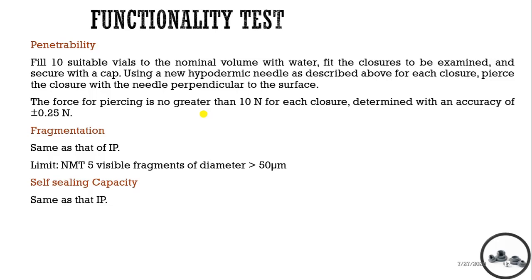Using a new hypodermic needle, we pierce the closure perpendicular to the surface. The force required for piercing should not be greater than 10 N for each closure, with an accuracy of ±0.25 N.